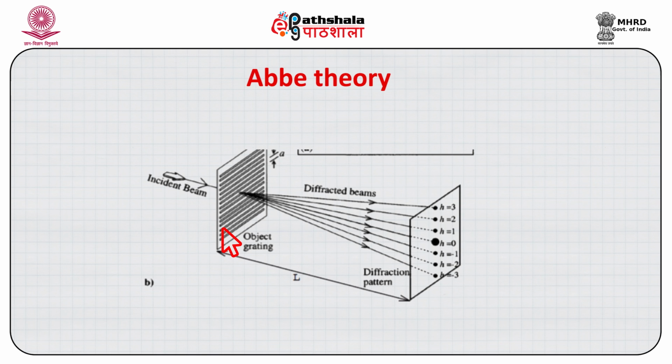The spacing in the diffraction pattern is reciprocally related, as I stated, and the diffraction pattern is normal to the line of grating or periodically spaced object. This leads us to the concept of reciprocal lattice.